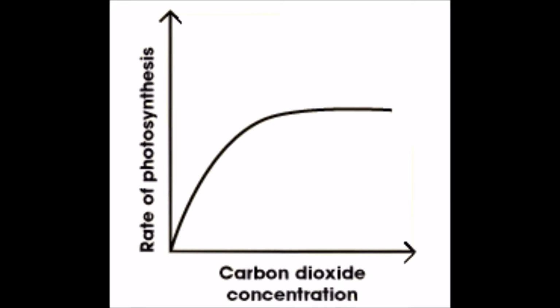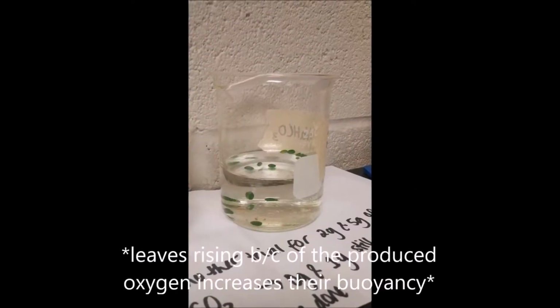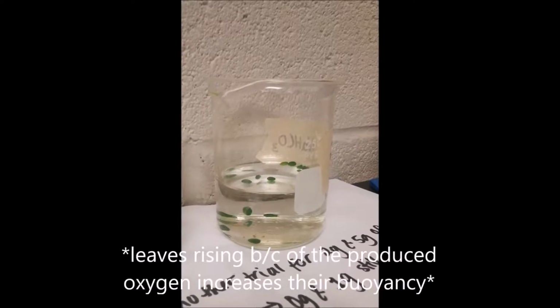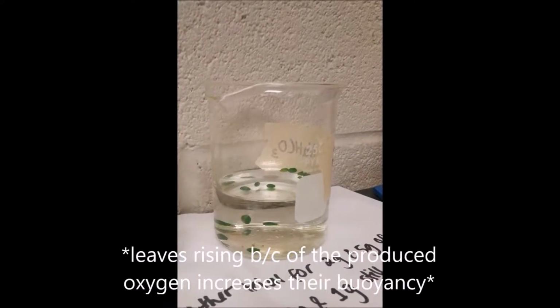Subsequently, more leaves will float, as additional oxygen increases the buoyancy of the leaves. In essence, when more sodium bicarbonate is present, the faster the rate of photosynthesis.